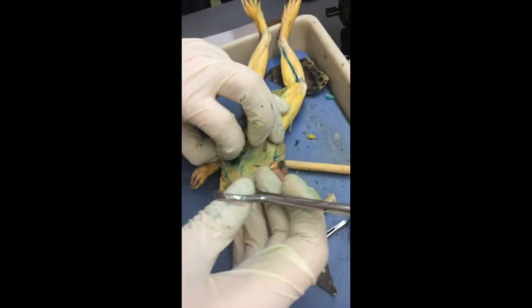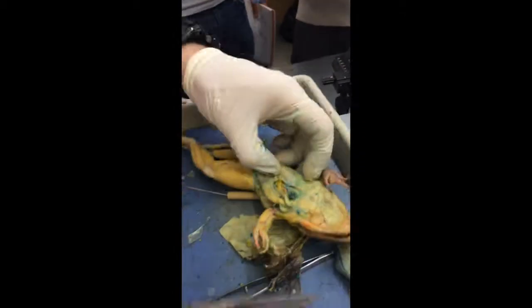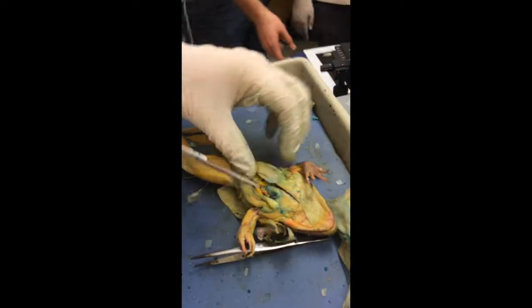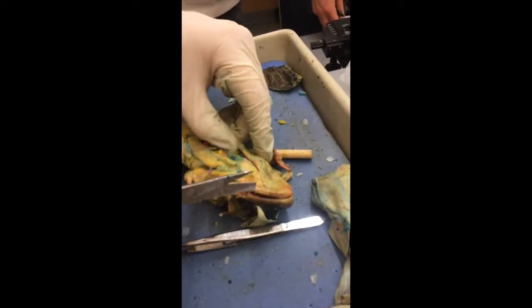There's already a cut in these because you had injections, although I'm still not quite sure why we got injected ones. You are responsible for both male and female in this organism, so make sure you see both the male and female frogs for the dissection. We cut straight up. So you're going to cut down the middle, and then cut on the side here, okay, to make flaps.